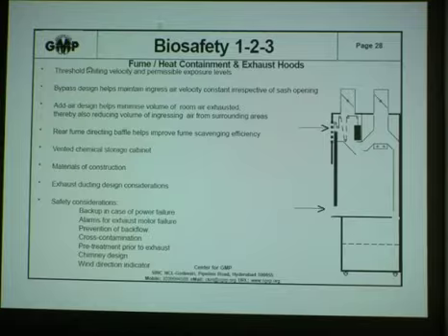Please remember duct velocities should be in the range of approximately 2000 to 2500 feet per minute. So you start with a duct which is, say, 10 inches in diameter, reduces to 8 inches diameter, reduces to 6 inches diameter, and to 4 inches diameter, so that there is a progressive acceleration of the exhaust stream.